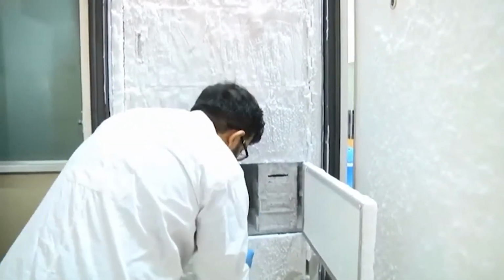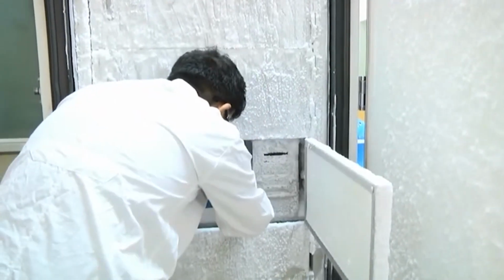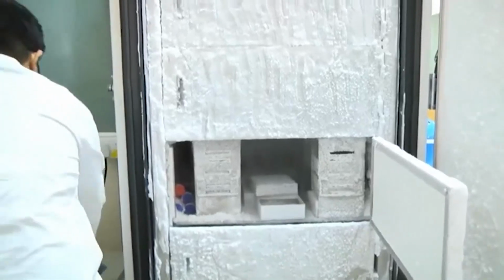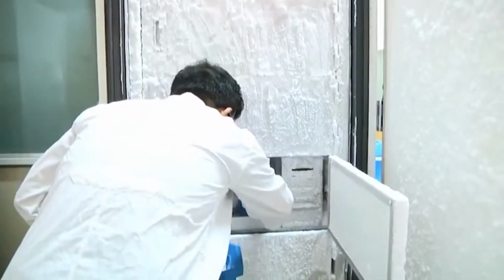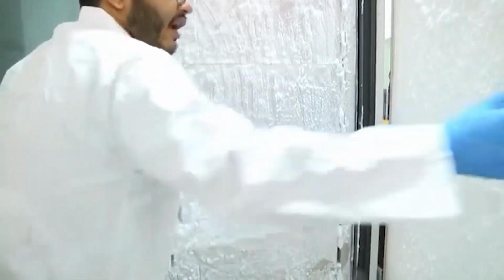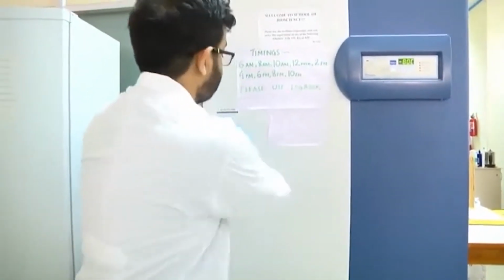I will just open my cell stock. Notice that I am not taking out the box. I will just look for my cells, and I have here an ice bucket. I am just going to take a vial, immediately put it in ice, and close the minus 80 degree centigrade freezer.